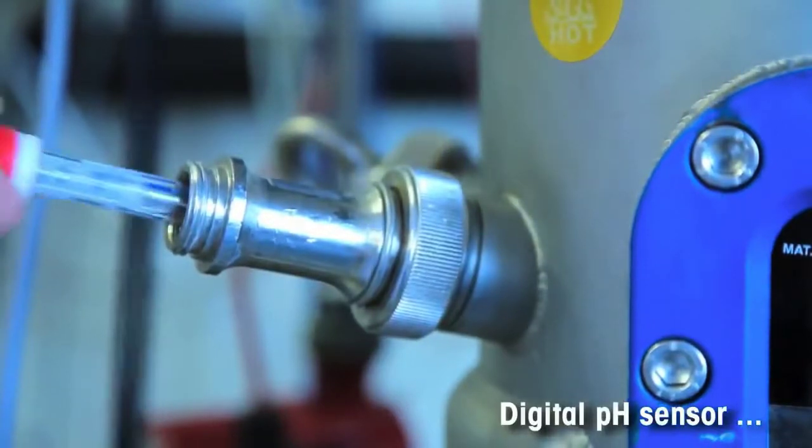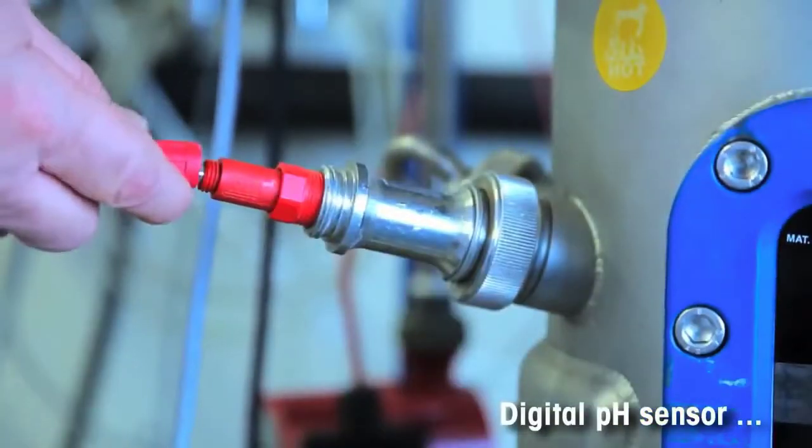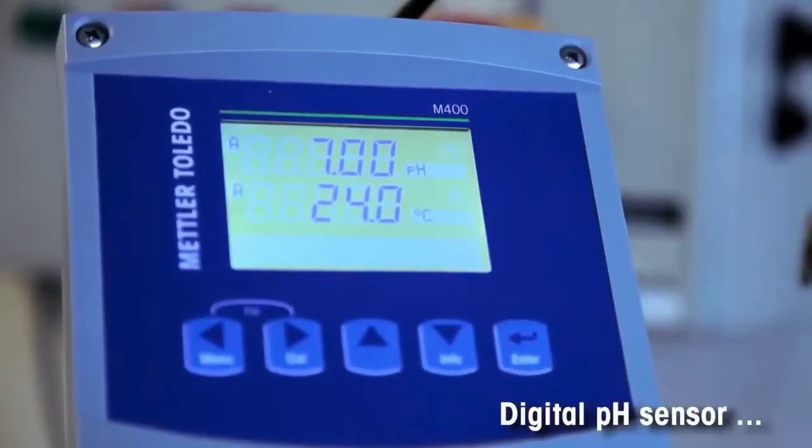Just connect the pre-calibrated digital sensor to the transmitter. The sensor is automatically recognized and calibration data is uploaded.